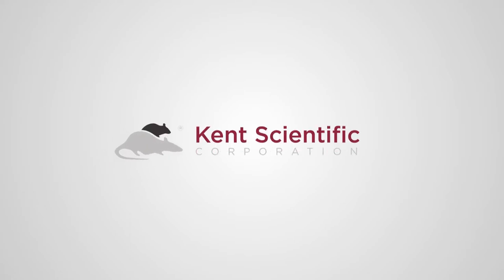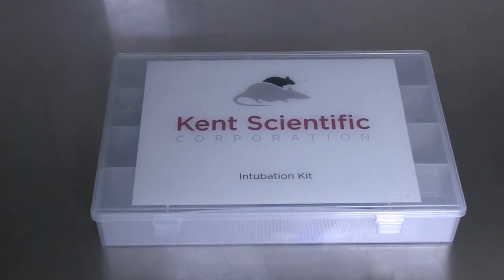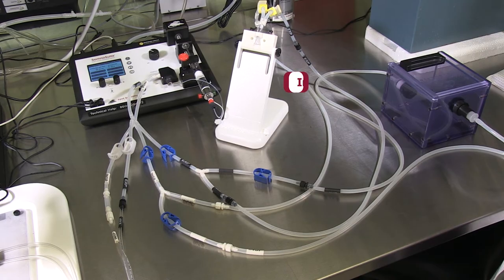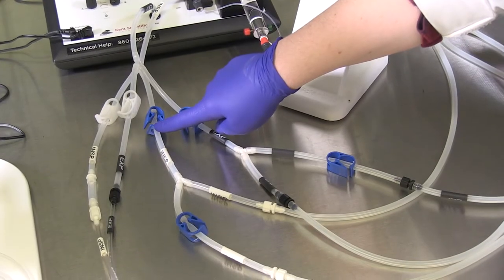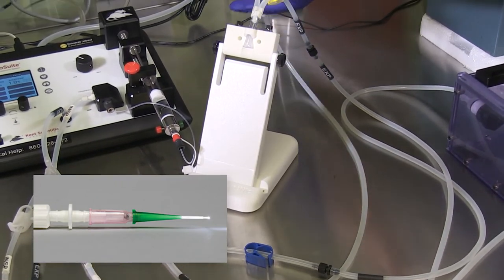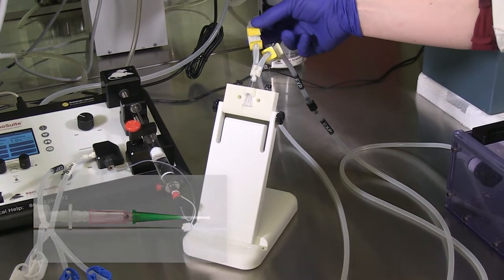Kent Scientific's endotracheal intubation kits are designed to reduce the challenges associated with intubating mice and rats. With an integrated anesthesia mask, the intubation stand allows for the delivery of anesthetic gas during the intubation procedure. The included endotracheal tube wedges reduce the occurrences of leaks during ventilation and also aid in proper tube placement during the intubation process.